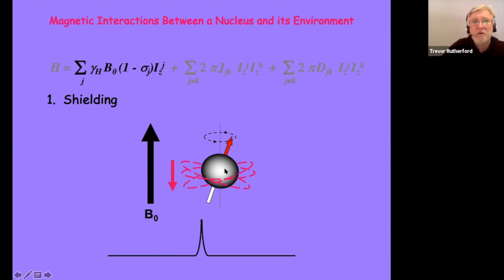Remember, we get a separate signal for every nucleus that is in the molecule. So we get structural compositional information at the level of functional group chemistry for every nucleus in the molecule. So it gives us a characteristic frequency, and as we said before, we depict this as normalized against the field strength. So in every spectrometer in the world, it will come out with the same chemical shift value for the rotation, the spin speed of that nucleus.